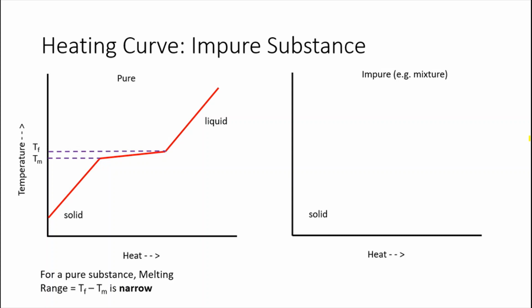As I begin to add heat, the temperature once more starts rising. But what's interesting is that the plateau is reached at a lower temperature. The plateau is not as flat, it's actually pretty steep also. And then you arrive again at the inflection where you are going to be converting the whole thing to liquid.